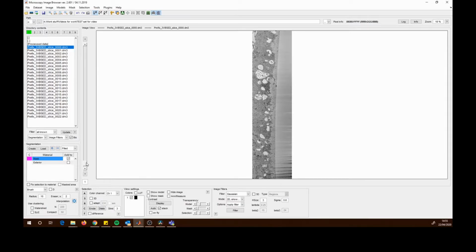So you won't be able to see much of a difference here, because we don't really have a particularly large change in contrast throughout the dataset. So that can be quite useful, as I said, for EM data like ours. It can also be useful on confocal data if you're doing big stacks of immunostain cleared tissue, because they sometimes have a decrease in signal as you progress into the tissue, and also a decrease in stain intensity because of stain penetration. I would imagine this feature could be useful for that as well.